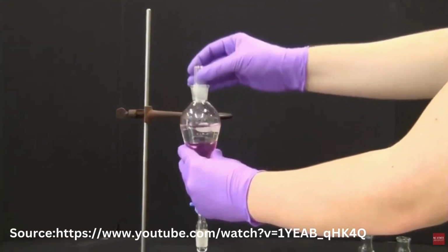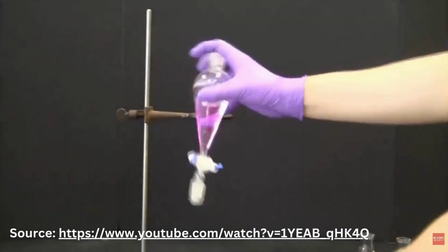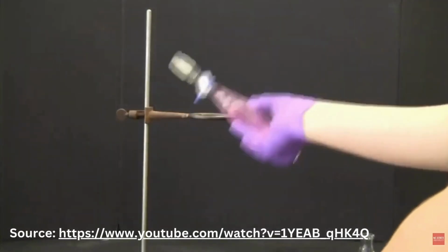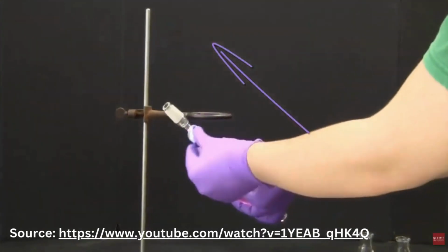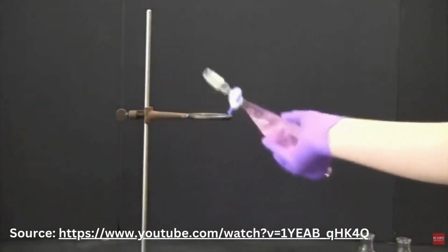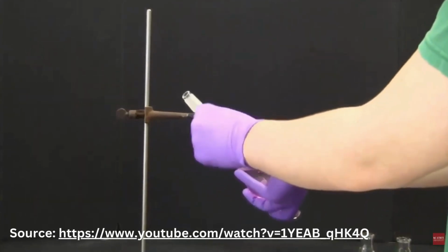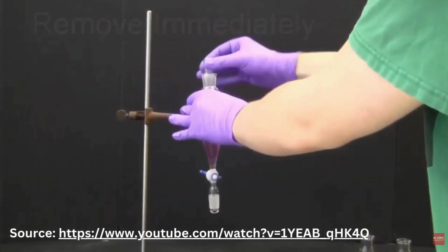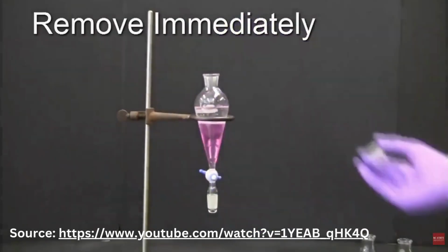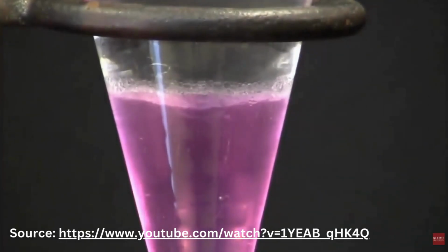Now close the funnel properly as shown in the video. Shake the funnel manually and remember to point the funnel away from the body. Open and close the funnel to remove all the gases. Attach the funnel to the retort stand and remove the stopper immediately. Let the solution in the funnel settle down until there are 2 layers.